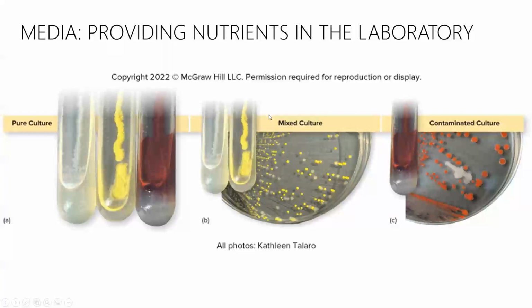Now, that said, you can go from a mixed culture, and I could take that one yellow colony with my loop and move it to a different agar, and then I would have a pure culture. But as it is, they're mixed, they're interspersed between the two.